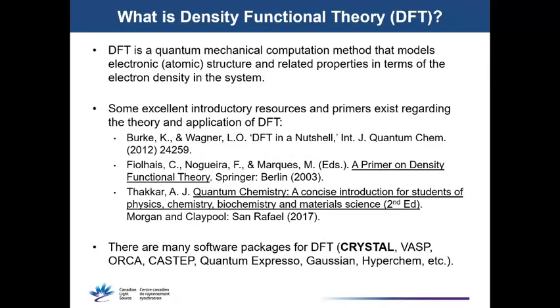So what is DFT? DFT is a quantum chemical technique that uses the electron density as the basic quantity to calculate the electronic structure and properties of a system. I don't have time to go into the theory, and I probably wouldn't do it justice anyways. So I've put a few really good resources here that you can read if you're interested in looking more. And there are many different programs that you can perform DFT with. At the CLS, we have a license to the Crystal software package. So that's what has been used for an example that I'll present here.